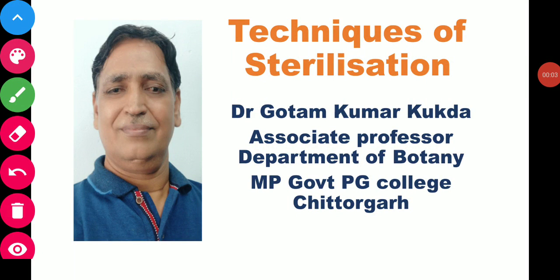Dear students, today we will have another lecture, techniques of sterilization, an important topic in plant tissue culture and some microbiological experiments: how sterilization has to be done, why it is done, and how microorganisms are restricted to allow growth of a particular tissue.